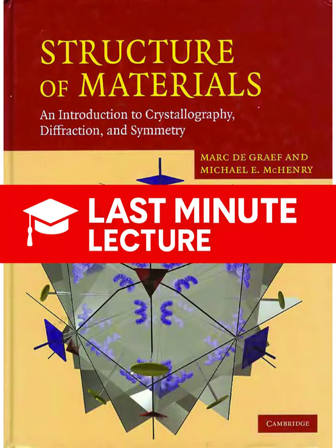Exactly. We can't directly see the atoms, but we can measure this reciprocal image, and then we mathematically deduce the real structure from that image. The crystal structure exists in real space, but all our experimental data lives in reciprocal space.